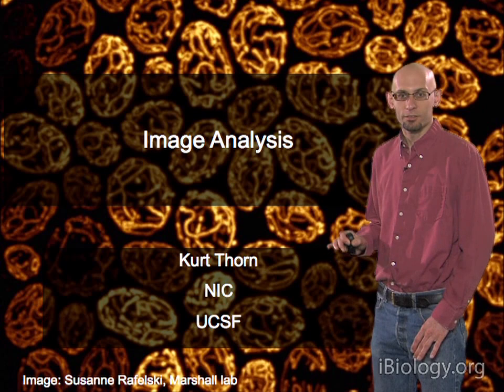And part of why that helps is because since there is redundancy in your image, if you have a single pixel that's really bright and everything around it is dim, you know that can't be real because any real bright object in your sample would be spread out over multiple pixels. And so a single bright pixel like that has to come from some kind of noise artifact. And so smoothing will help suppress those artifacts and give you a better representation of what your underlying image looks like.